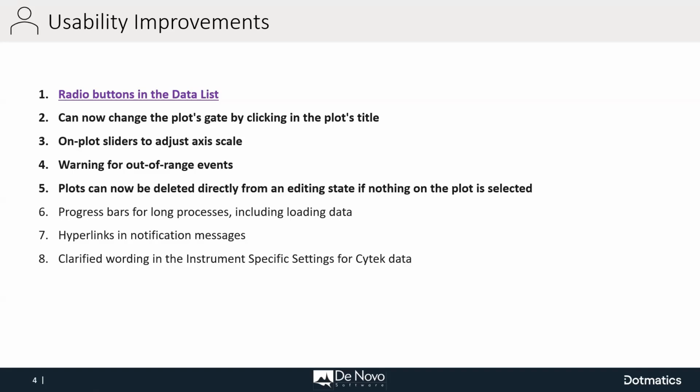But if it takes 2 seconds, 3 seconds, 10 seconds, then you will see a progress bar. This is the same as when you run high dimensional data analysis, like a t-SNE: you will see a progress bar telling you the progression of the calculation.